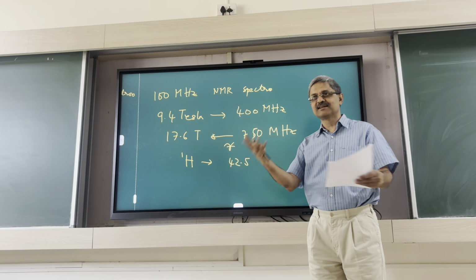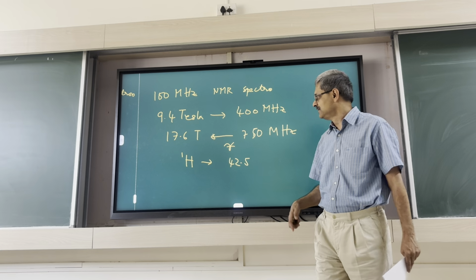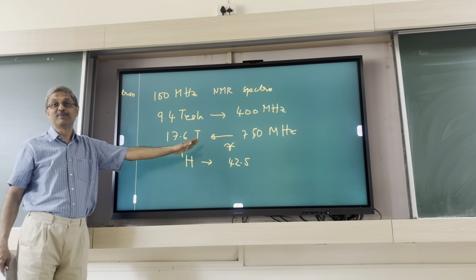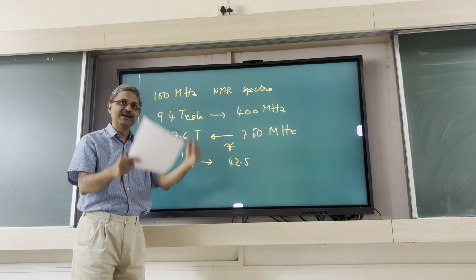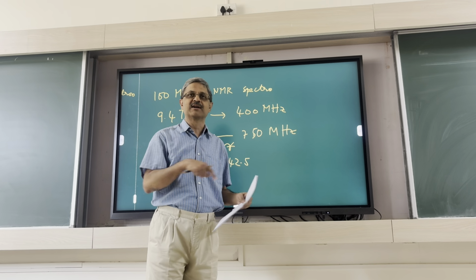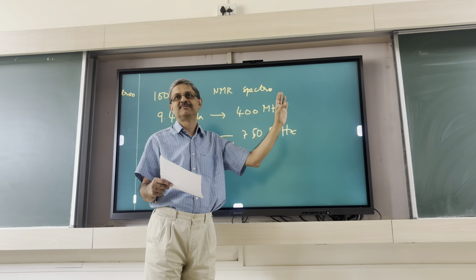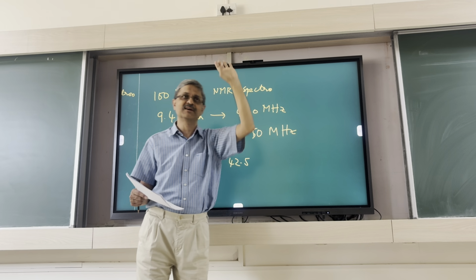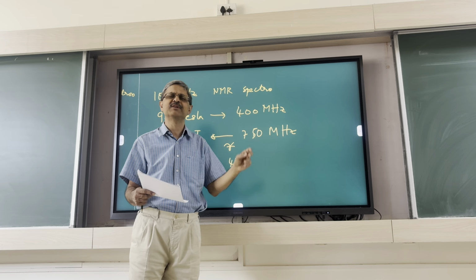Agreed, bigger the field, the better the sensitivity. Not always, but usually you want higher fields. The biggest we have here is this one. These are all persistent magnets. So they are superconducting magnets in a liquid helium bath. The first time they are installed, an engineer comes and sets up a current, and then if all goes well, that should remain forever. Right? With superconductors, the decay time is 10 to the power something, astronomical lifetimes. So it should be there forever with very little drift.